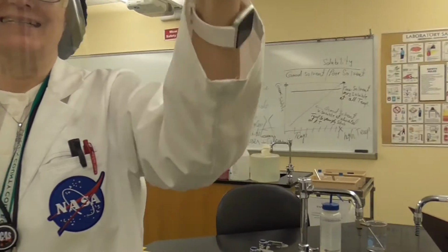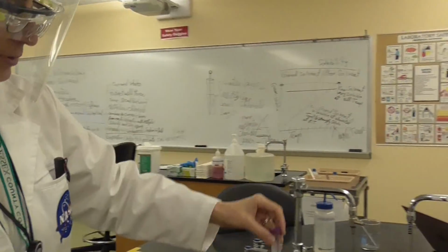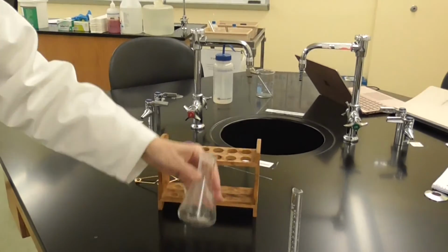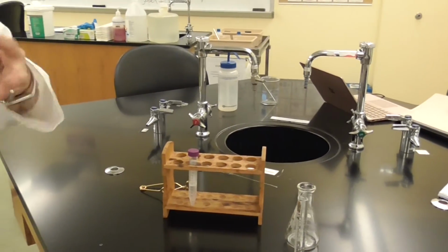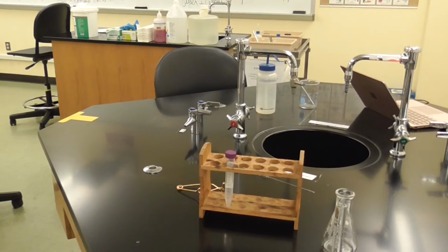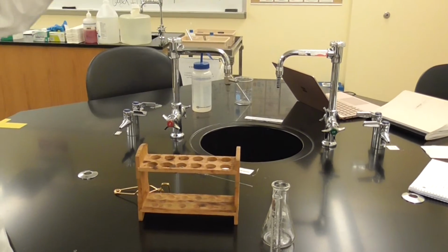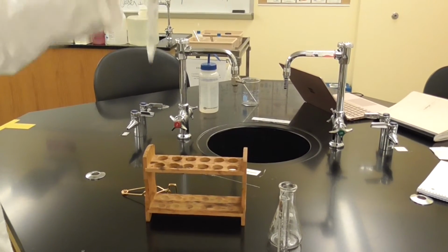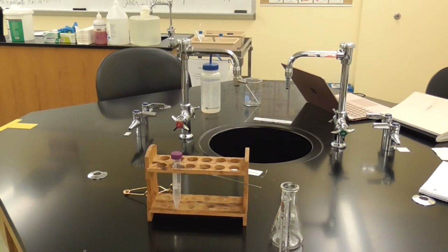I'm going to mix it again. This is the third time or second time? Second. So that's the second time. I'm going to leave it here, and then we're going to transfer it to the Erlenmeyer flask and do the third time. And after that, we're going to use the drying. Give it some time to settle, and then you're going to do the same thing. You're going to extract the lower layer.